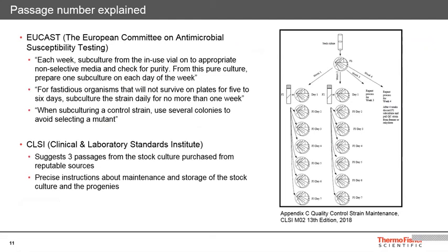F1 vials are prepared from the stock vial. It is advised to keep the F1 vial for no more than 1 month. Use them to prepare weekly cultures called F2, and using the cultures in F2, prepare the daily cultures F3. It is recommended to discard F2 cultures on a weekly basis, and start fresh with a new F1 culture the month after.